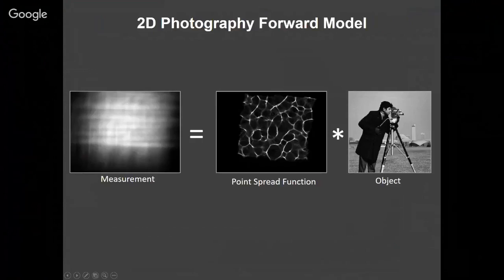It's a little bit more complicated than that, because as the point spread shifts off the edge of the sensor, we need to account for that cropping, which we do. You can simply put it in, so it makes it not quite a convolution, but pretty much the idea is that it's a convolution. We also sometimes add some regularizers that are nonlinear, but I won't really talk about that right now.